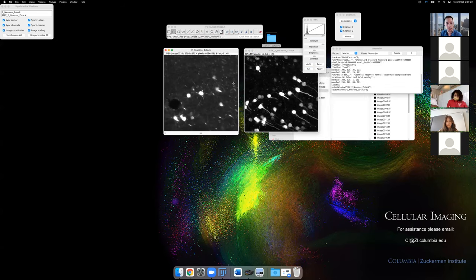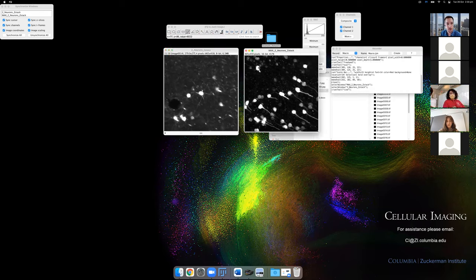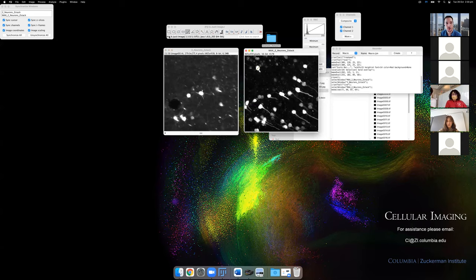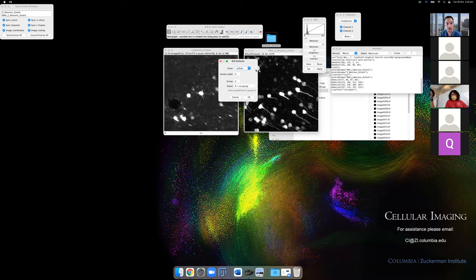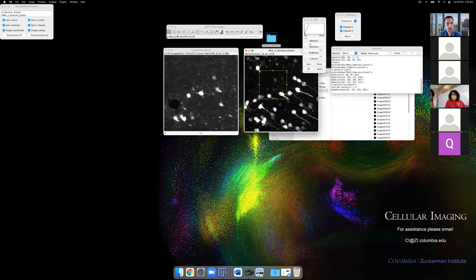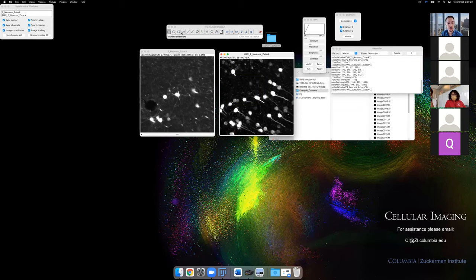With correct scaling, if you draw a line, the status bar shows you the length in physical units. Similarly, drawing a box shows the area in the status bar. For many workflows you'll want to measure where cells are, how intense they are, and what proteins are expressed. In the worst case this means manually drawing on the image, but the next couple of workshops will show you how to do things automatically.